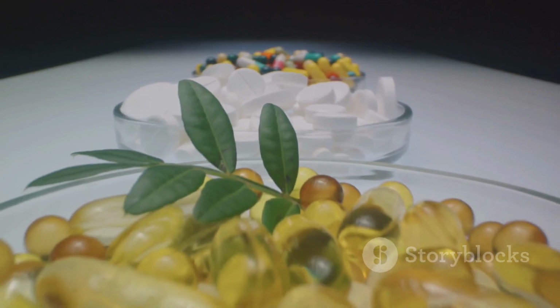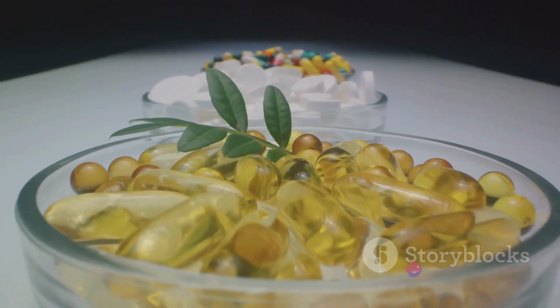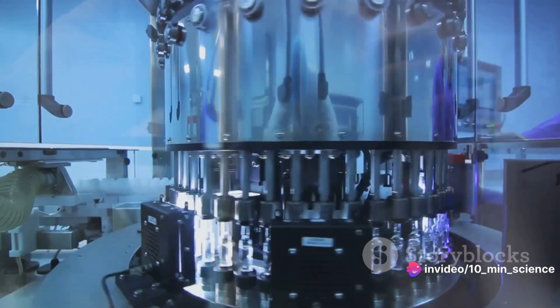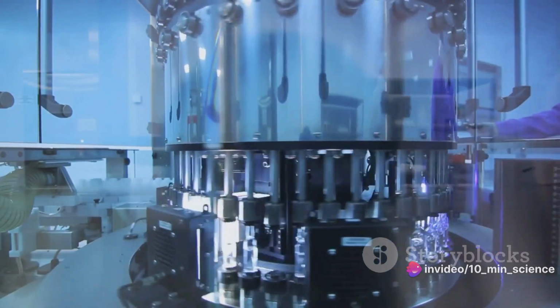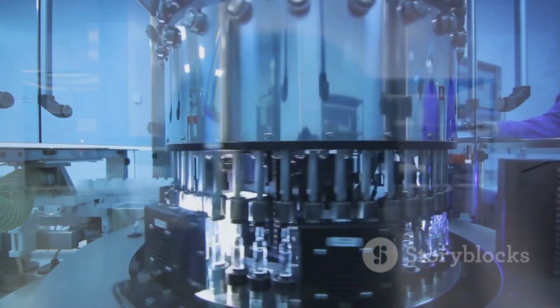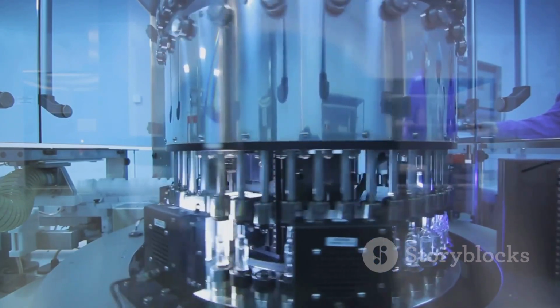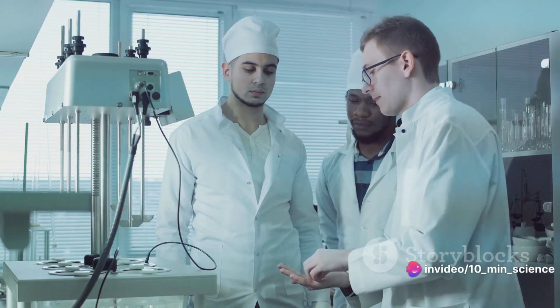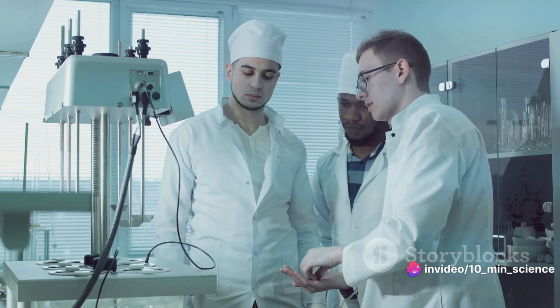That's where the Alginates assay comes into play. An assay, in pharmaceutical terms, is a procedure used to measure the quality and purity of a substance. It's like a quality check, ensuring that the alginates used in our medicines are of the highest standard and are safe for consumption. For alginates, the assay is outlined in the United States Pharmacopoeia, Chapter <311>.